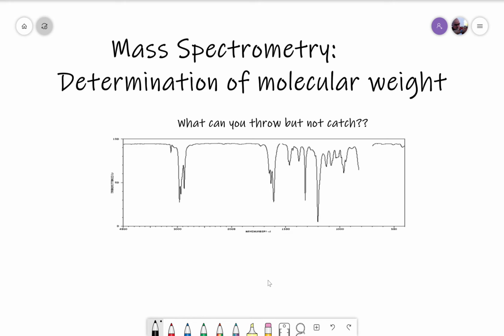This video is an introduction to mass spectrometry, determination of the molecular weight of an unknown compound.